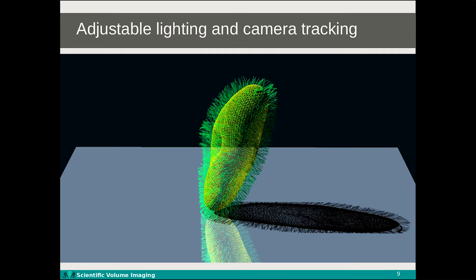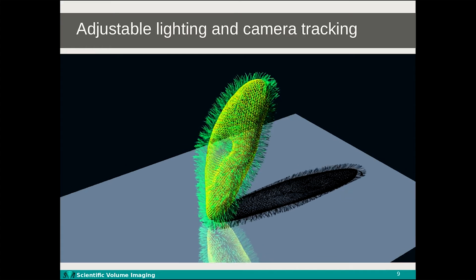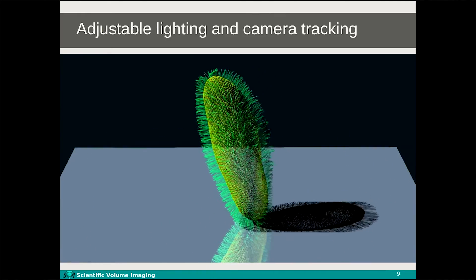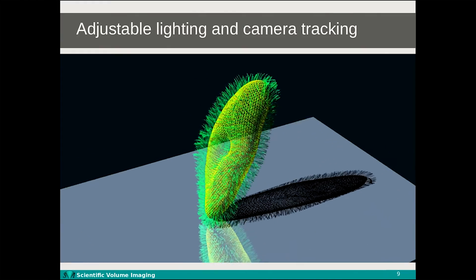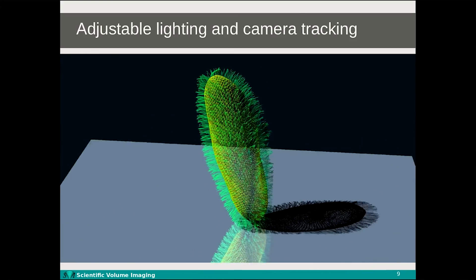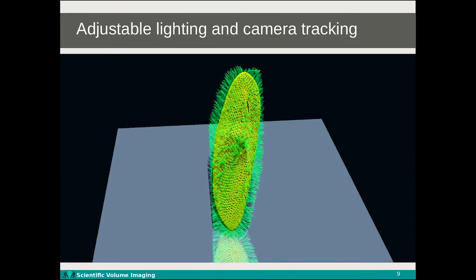A new feature in Huygens 19.04 is fully adjustable excitation light direction. Both the zenith and azimuth angle can be freely set and animated. The excitation light can be locked to the object or to the camera — this is called camera tracking. When locked to the object, shadows in the object and on the table do not change as you rotate. When locked to the camera, the excitation light rotates with the viewer and the shadows flow through the object, highlighting different regions at different times.